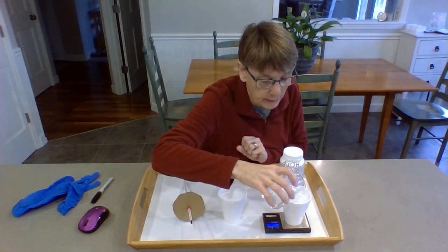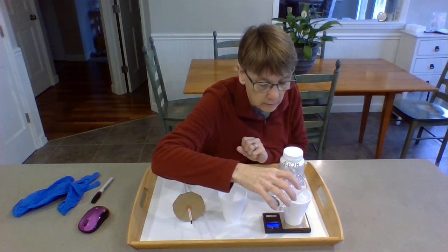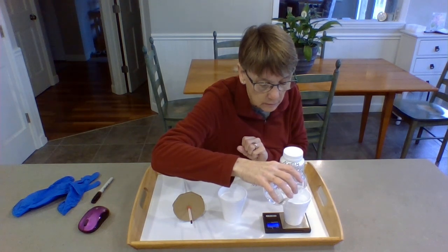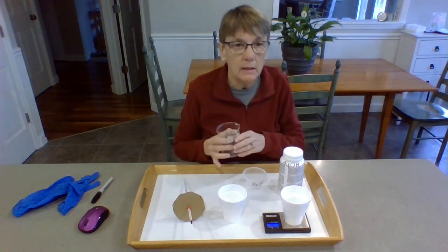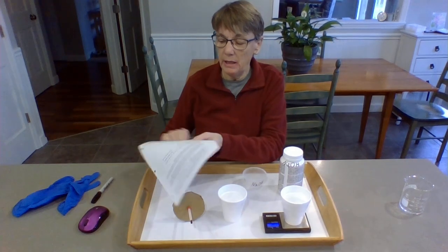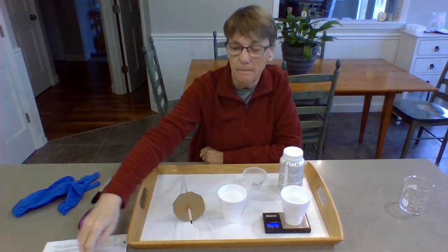It doesn't have to be an exact number, just anywhere as long as you're in that range. All right, I'm going to stop there. 118.3 grams. So on your data sheet, that is going to be the mass of the vinegar from step 4.